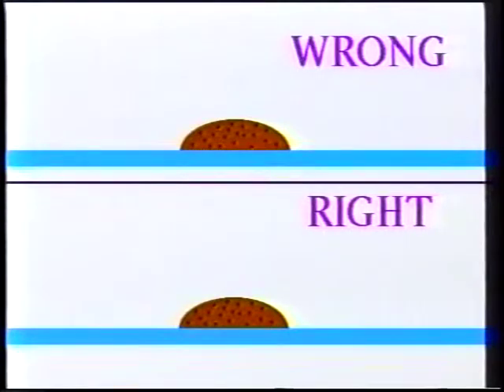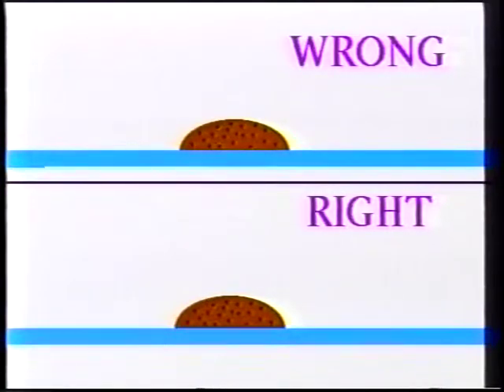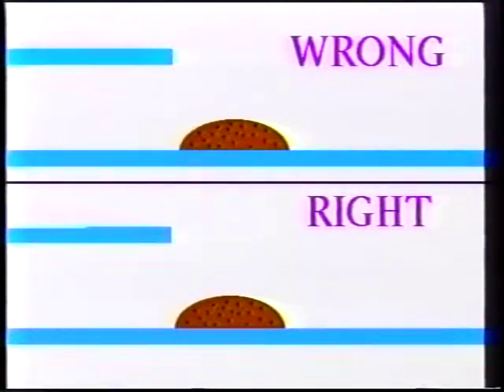Another common problem is failure to keep the slides parallel throughout the smearing. If smearing is started with the slides at a slight angle, the harvest will be scraped, resulting in loss and severe artifact. A variant on this is to start smearing with the slides parallel, but to angle the slides like this halfway down, resulting in a partially distorted smear. On the left, there is a smear with scrape artifact starting halfway down the smear, compared to the oval smear without distortion on the right.